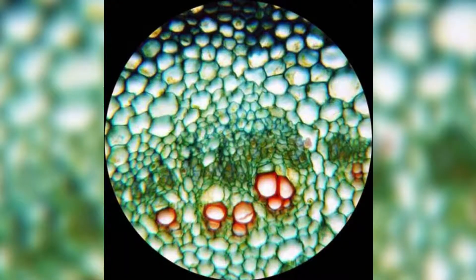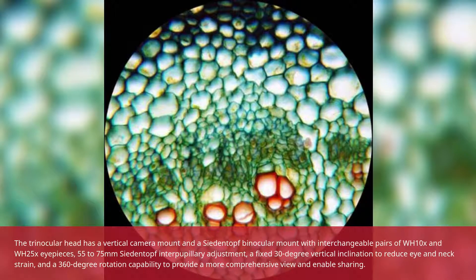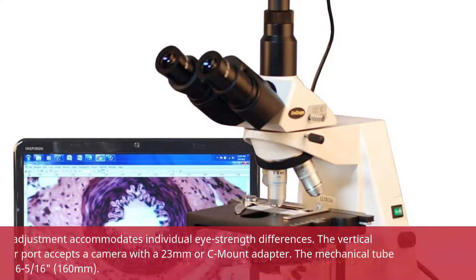The Trinocular Head has a vertical camera mount and a Siedentopf Binocular Mount with interchangeable pairs of WH-10x and WH-25x eyepieces, 55–75mm Siedentopf interpupillary adjustment, a fixed 30-degree vertical inclination to reduce eye and neck strain, and 360-degree rotation capability to provide a more comprehensive view and enable sharing.